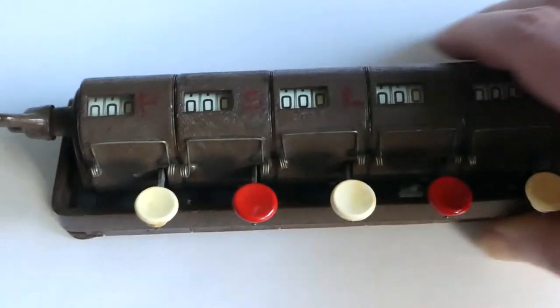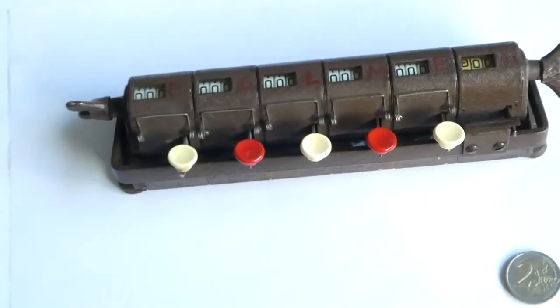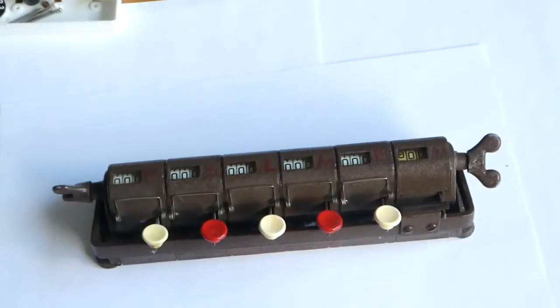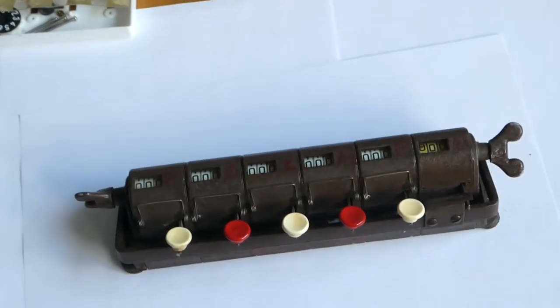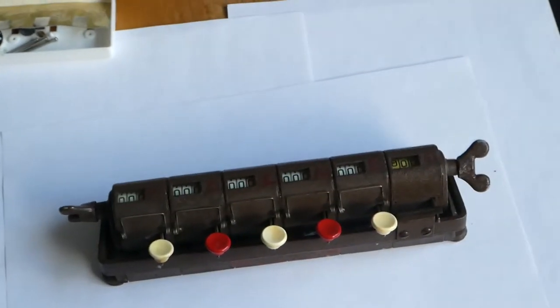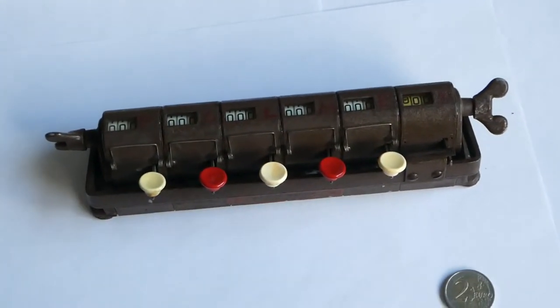And the company still exists. It is still making counters like this one, but with a more modern mechanism and a plastic shell.